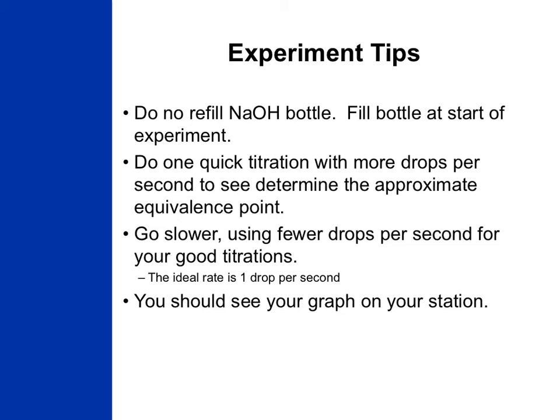A couple of tips for performing the experiment. First, fill your storage bottle with sodium hydroxide. You will then only use the solution that's in that container. The large carboys can have slight variations in concentration throughout and may have been refilled during your lab, which can cause changes in the concentration of the solution. The goal, remember, is to accurately know the concentration of the solution, and any small variations can cause it to become inaccurate. So please do not refill your bottle.